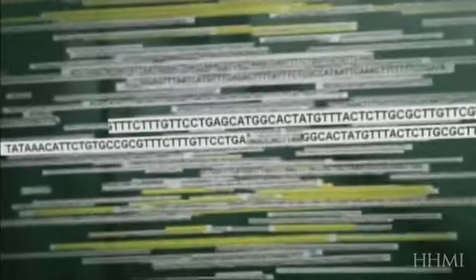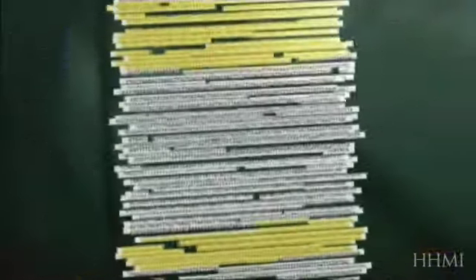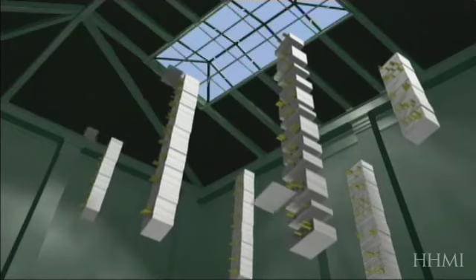Although it looks fairly orderly, this step is small-scale shotgun, which creates numerous random fragments. Each fragment is sequenced. Then computer programs align the overlap between fragments to build up an entire page. Marker sequences, shown in yellow, help establish the order of pages in the Book of Life.